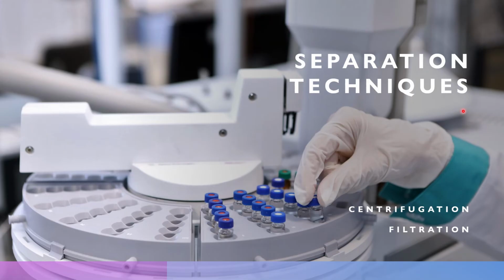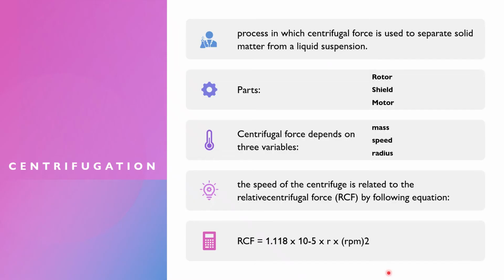Let's now proceed to the separation techniques. There are actually two separation techniques that we will be discussing. That's centrifugation and filtration. Centrifugation, class, is a process in which centrifugal force is used to separate solid matter from a liquid suspension.